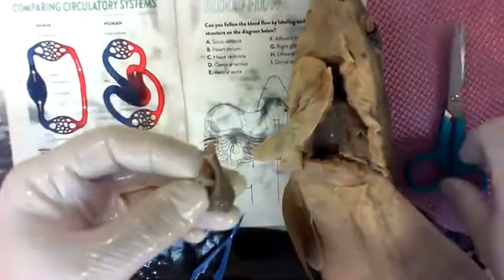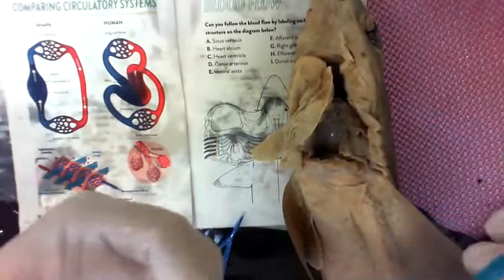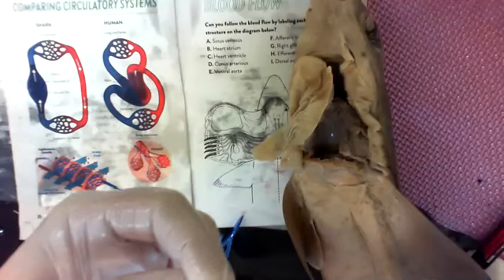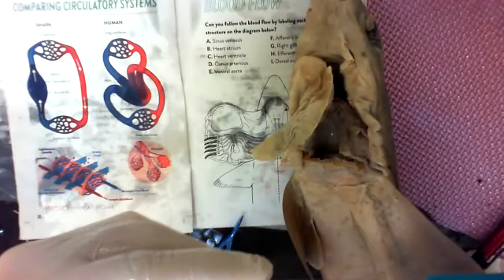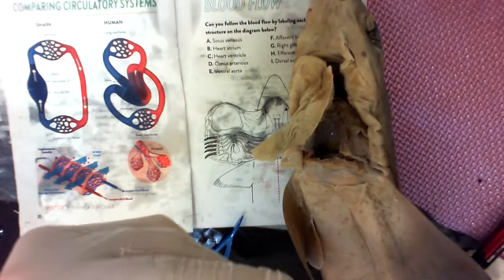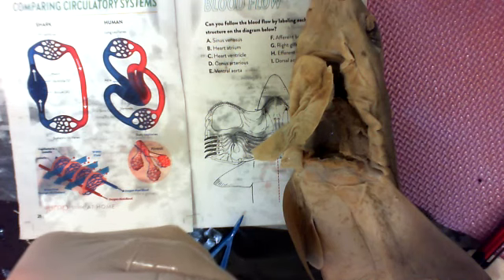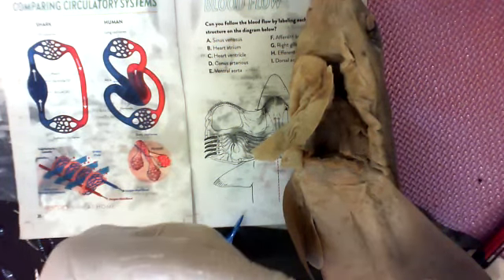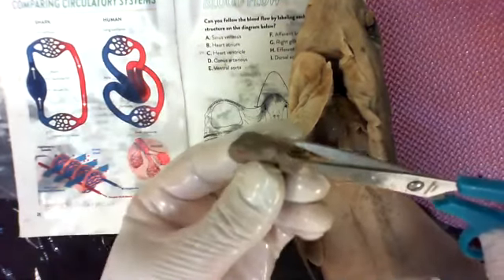Let's cut that thing open. I want to see inside. So I'm a huge fan of going backwards. I like to reverse engineer. Take my toys apart, figure out what's wrong with them, then put them back together. Snip. So I'm going right down the aorta. Snip, snip. Snip, snip. Wow, I can really see the blood vessels on the surface. Oh, sorry. Too busy staring.